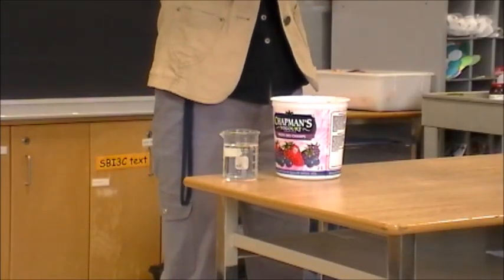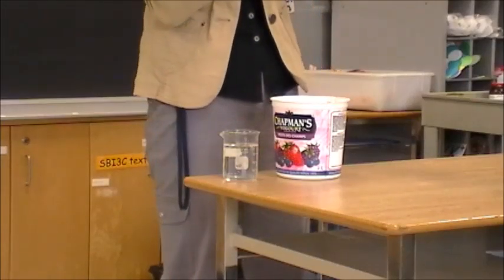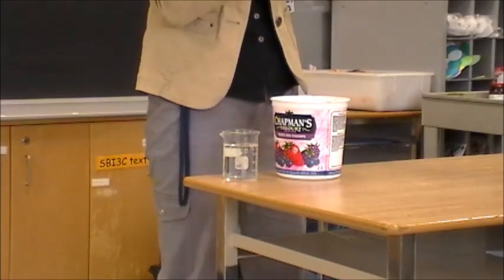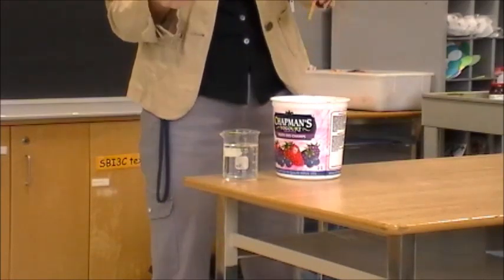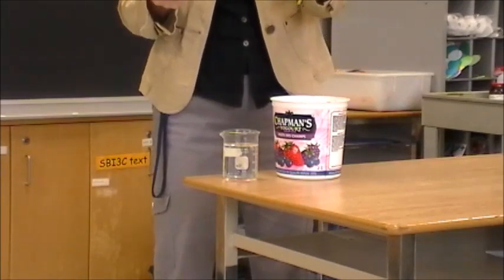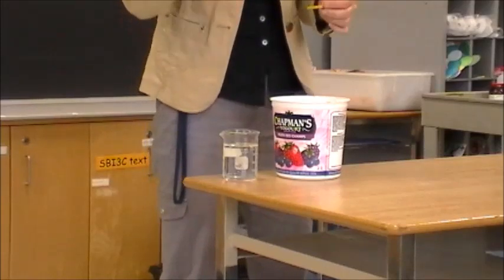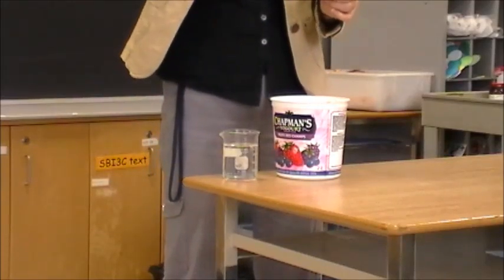So you need to add that to your signs. The pH paper turned green in the reaction side, the one where potassium, sodium, and lithium were reacted. And in pure water, it stays orange. We are now ready for the next part.